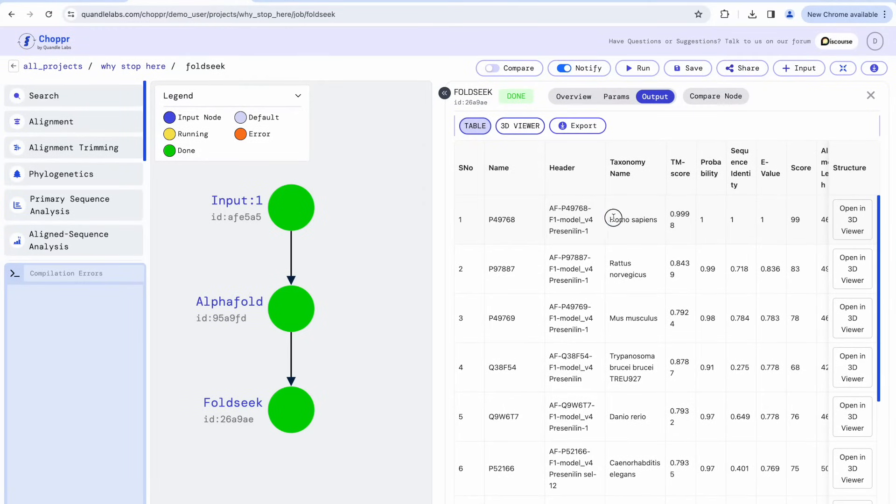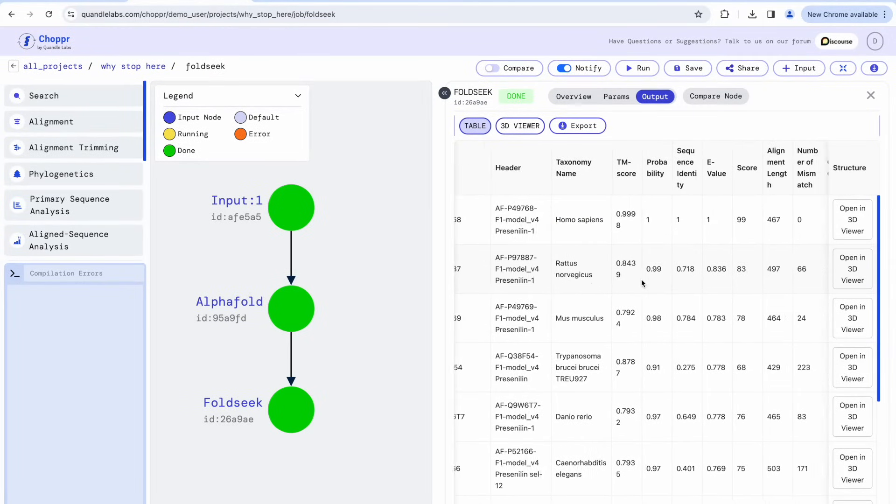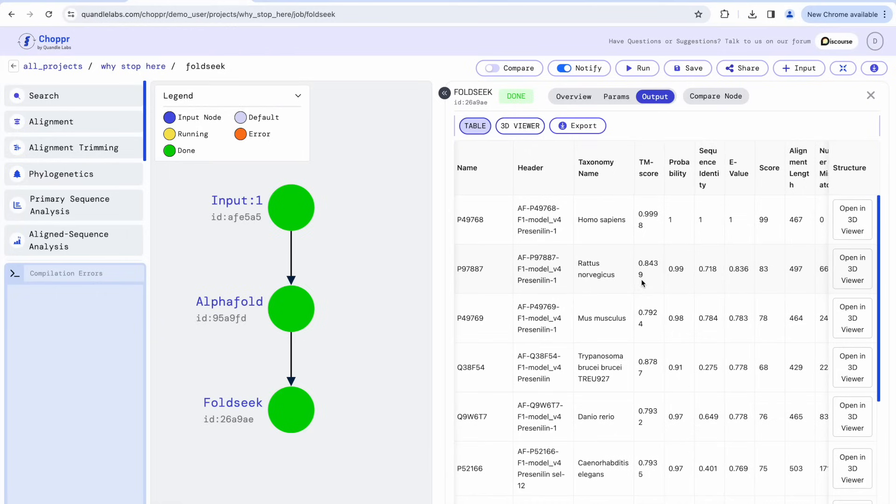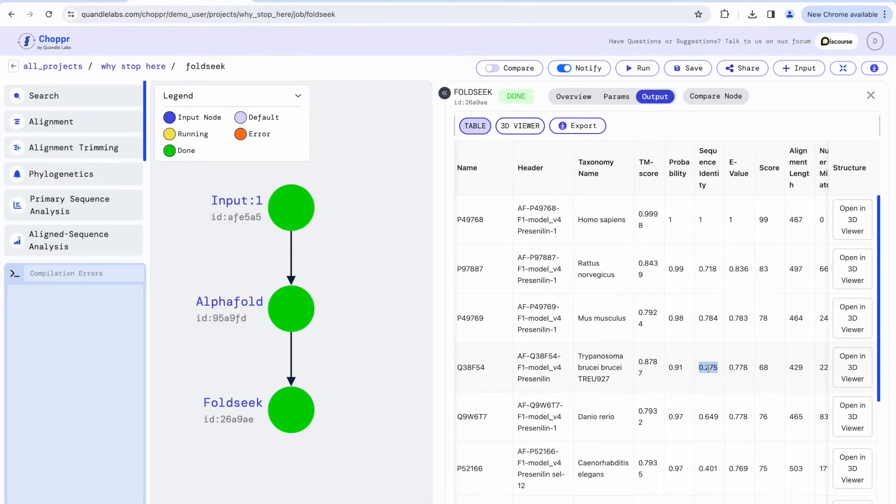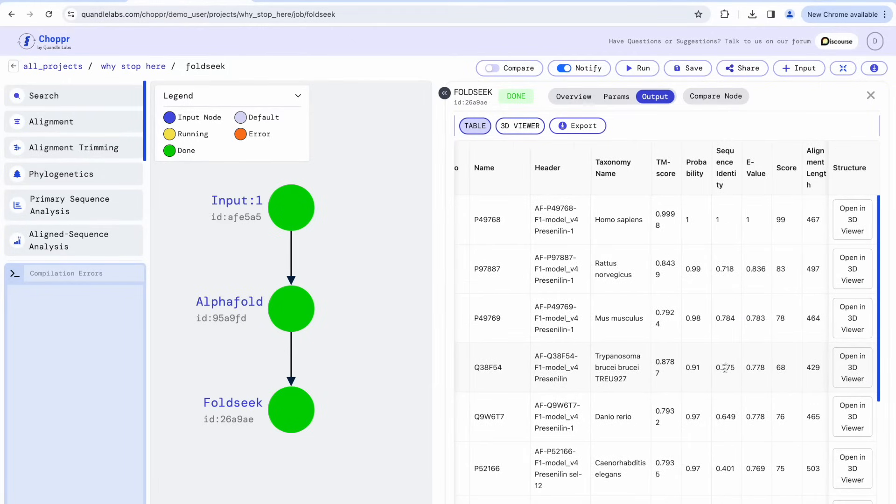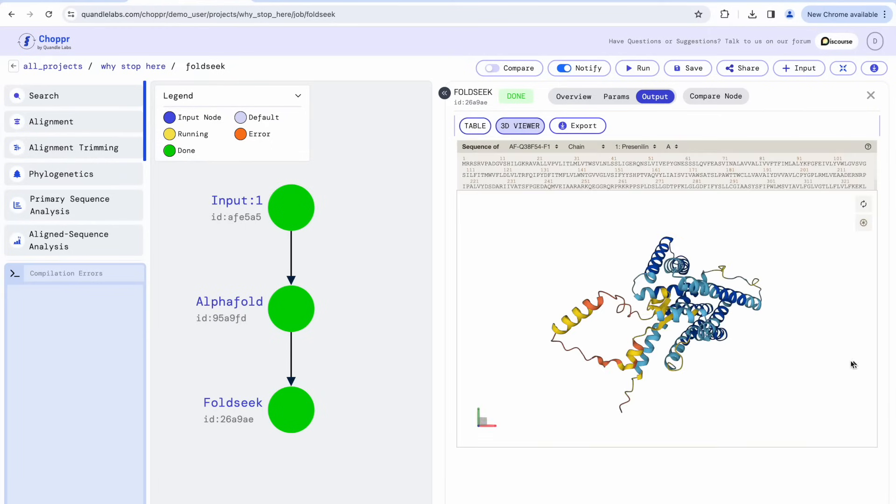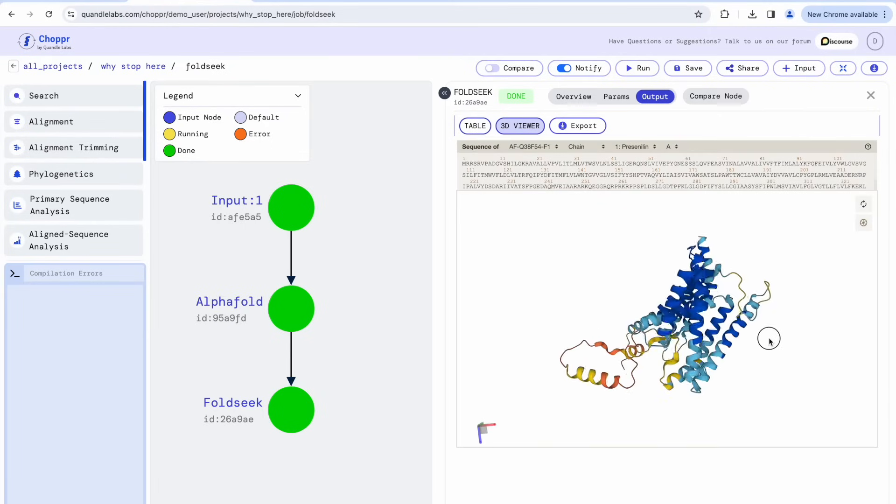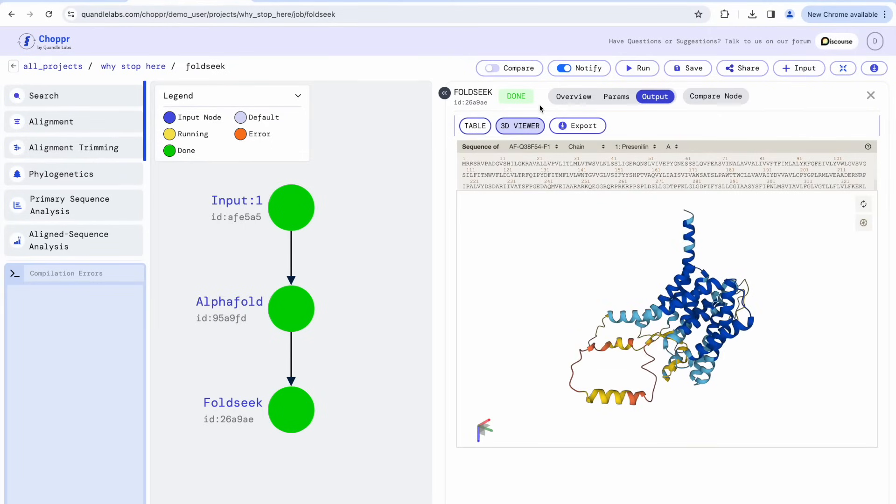The first result is our input sequence, and all other results have low sequence identity. These sequences are from different organisms with very similar structures. Let's compare the structure of the trypanosoma sequence, which has a sequence identity of 0.2.